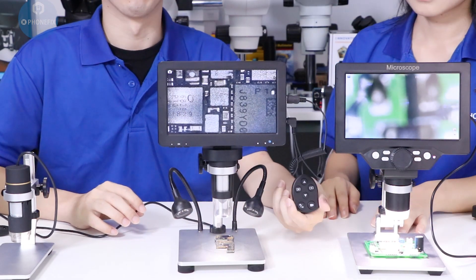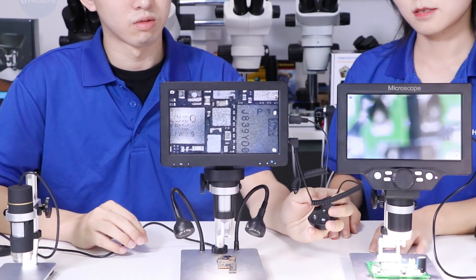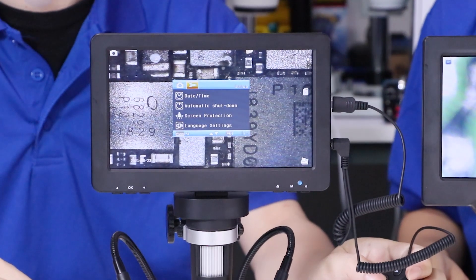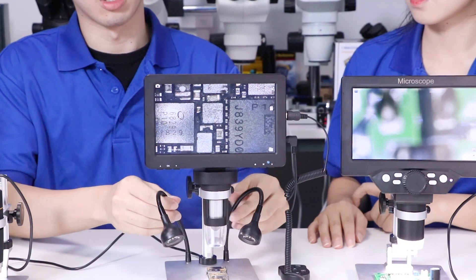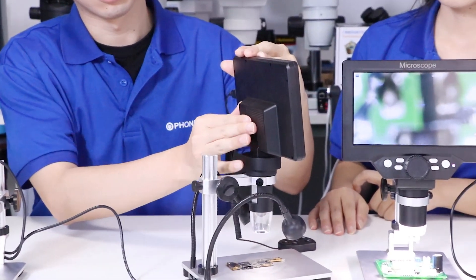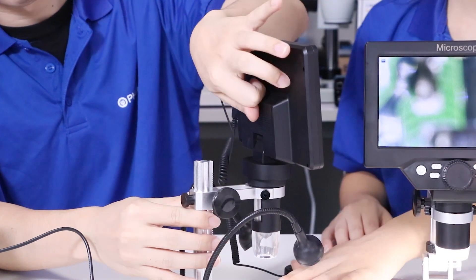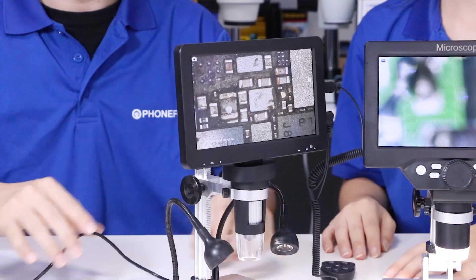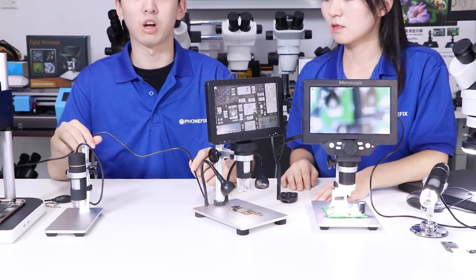Here is a remote control. You can install the battery on the back and open it here. With a USB cable, you can also connect it to the computer for charging.